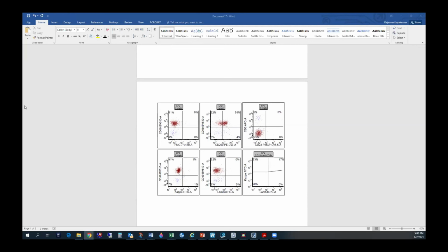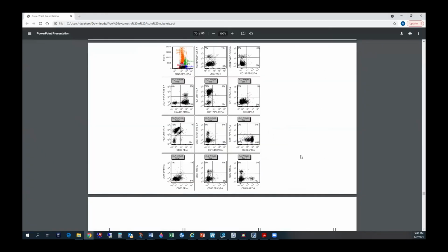So when you have abnormal plasma cells, that comes in the plasma cell tube. Okay, so normal plasma cells will be CD27 negative and abnormal will be positive? No, normal would be positive. Normal will be positive and abnormal will lose the expression. Lose it, yes. Okay. And also sometimes we used to have CD81 as well. So CD81 is also helpful. They will lose CD19, they will lose CD27, they will lose CD81, they will gain CD117, they will gain CD200. So all of those things are abnormal. Okay, got it. Thank you. CD56 is very important too.